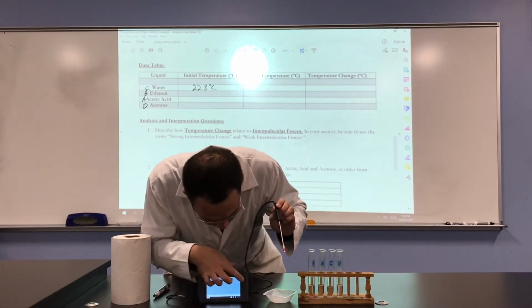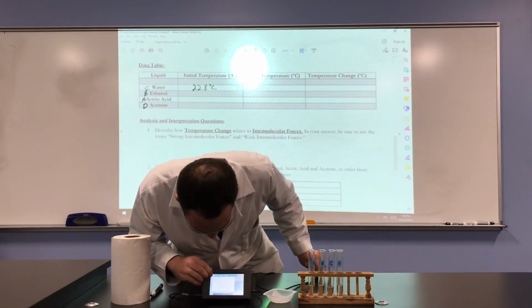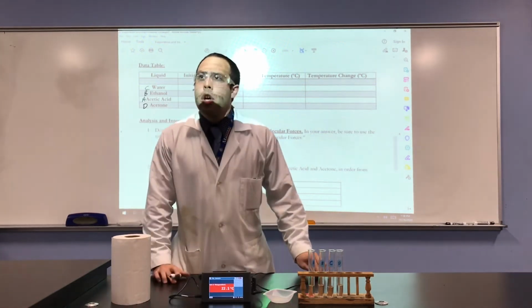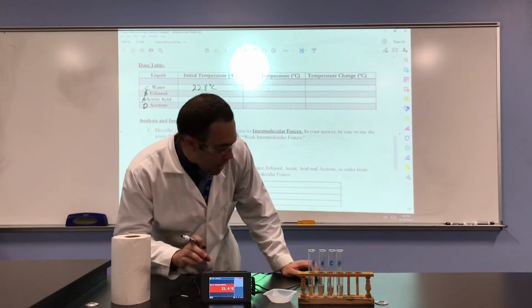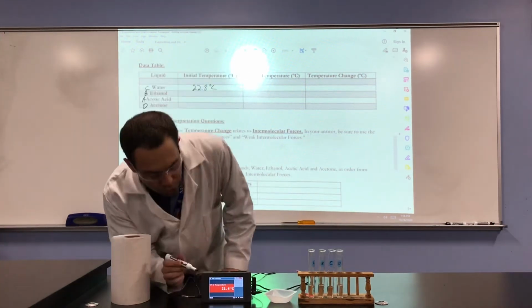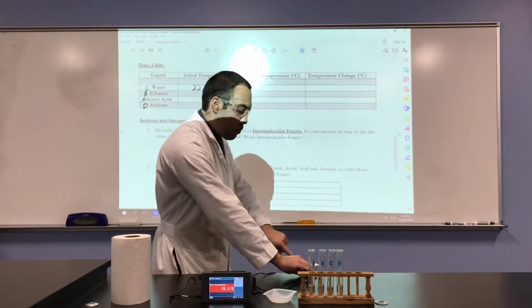And click play. Discard previous data. And you're going to see it go down. So in 3 minutes, the graph should stop moving, and we'll record our final temperature. As you can see, the temperature is decreasing. The water is evaporating from the filter paper.